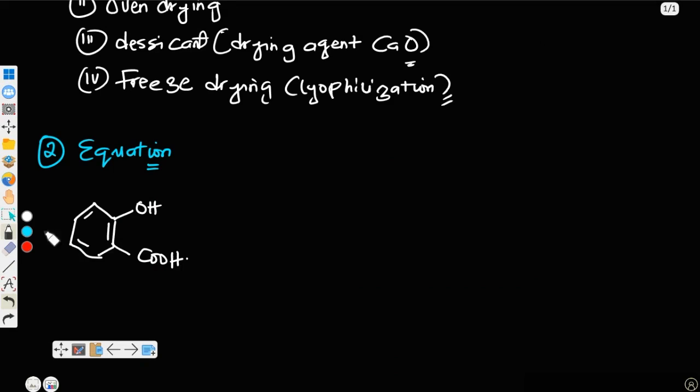So you can come plus. Now they put a comma here. You have to fill that in there. Now what will you react with orthohydroxybenzoic acid, which is salicylic acid, to give us aspirin, which is acetylsalicylic acid? You are going to react acetic anhydride, or you can say acetic acid anhydride. This is how acetic anhydride is. They are the acid anhydride.